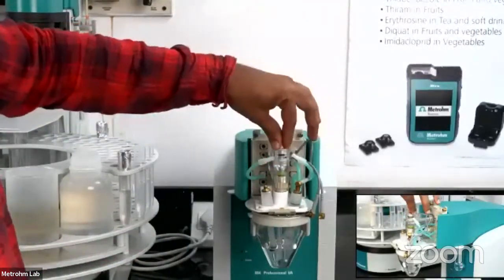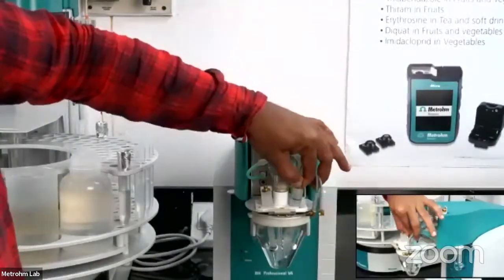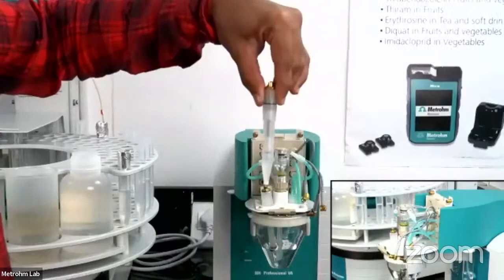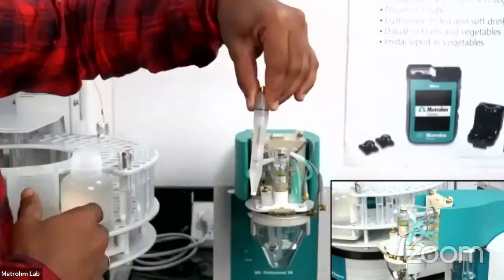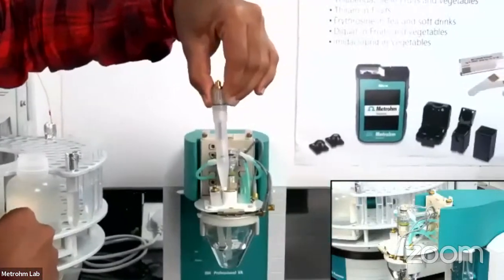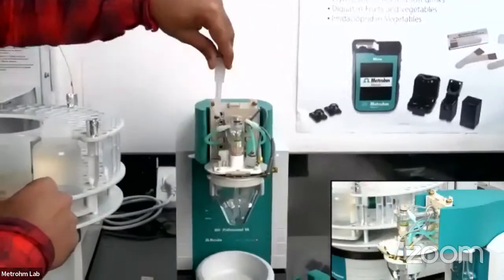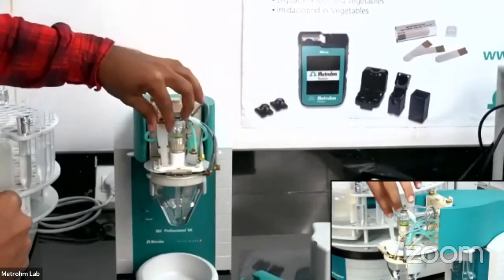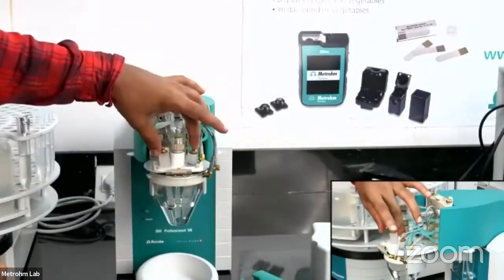In addition to the working electrode, we have two more electrodes. One is over here, which is a reference electrode. It's a normal Ag/AgCl reference electrode. In the olden days, people used to use a calomel electrode system. Instead of that, we have an Ag/AgCl silver chloride reference system with 3 molar KCl as the bridge electrolyte over here. And we have a third electrode, called the auxiliary electrode, which is basically a platinum electrode. So we have different combinations available with this. One is mercury and Ag/AgCl reference with platinum.